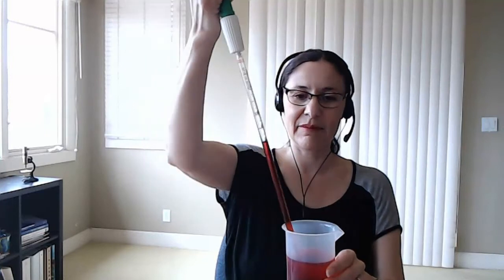Okay, I'm going to open it up. Now notice that your pipettor has a little roller here. This is what we're going to roll to aspirate our solution up. The process of drawing the liquid is referred to as aspiration. So I'm going to hold this and I am turning the wheel and you'll see the liquid that's being drawn. See that? Let's say that this is the amount of volume that I want to draw, or I want to draw more. I want to draw 10 ml.